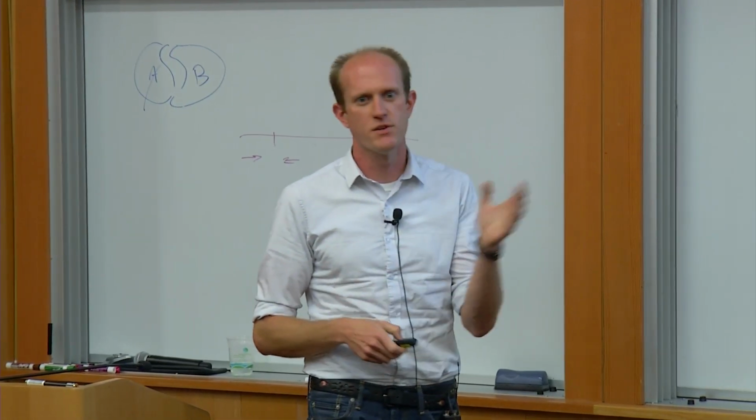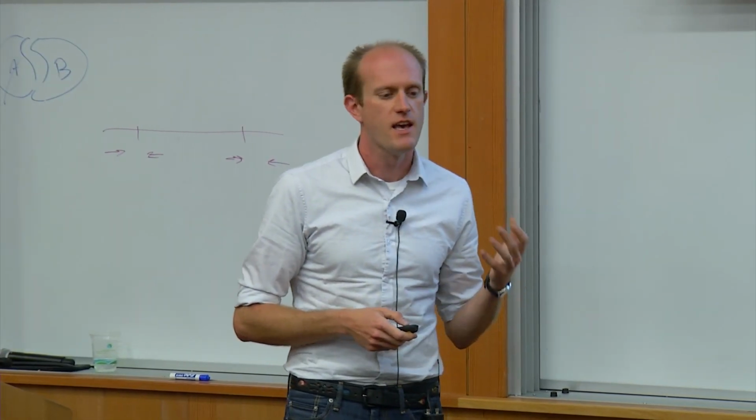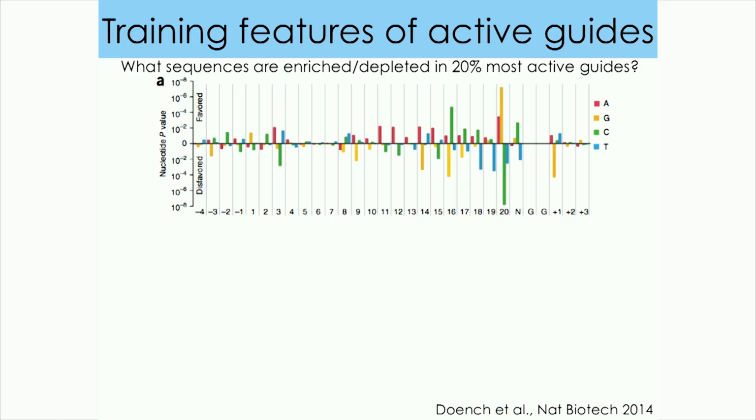And you do it across every cell line that you've looked at, and you hope that all of these specific things even out. Okay? And from that, there are actually a couple of really interesting trends that pop out.